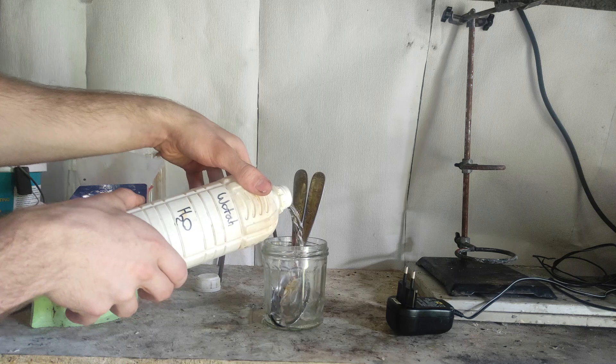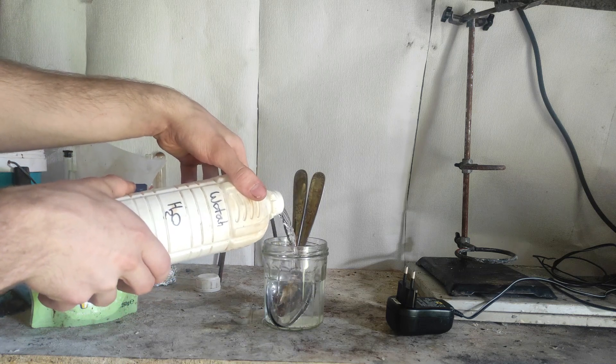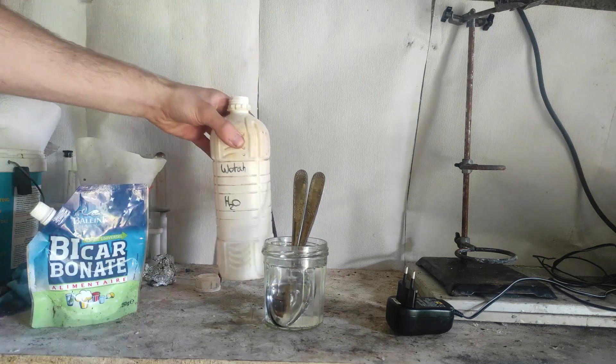We start by making a weak solution of sodium bicarbonate or another salt. Then we use two stainless steel spoons as electrodes. The current needs to be as high as possible.